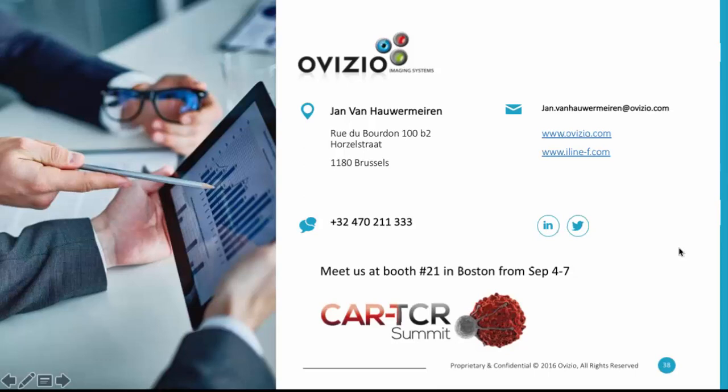All right, and this is a comment followed by a couple questions. Matthew says, thanks for the great webinar. I'd like to know more about holographic microscopy. Are there any limitations as far as what illumination you can use? We are using a very specific setup in our holographic microscope. It uses red LED light.